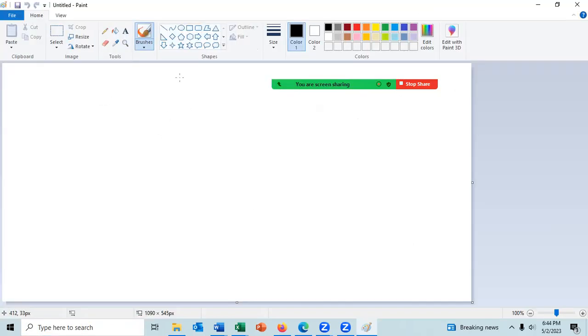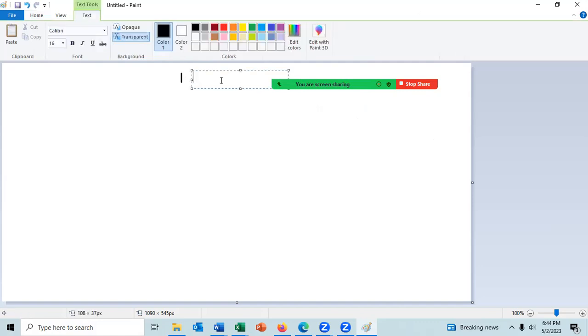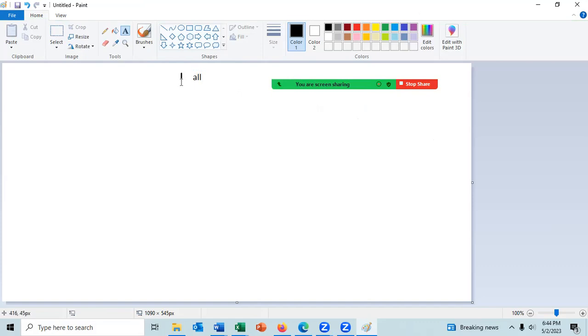Which initially we're kind of doing that, and that is we're doing gelatin hydrolysis test first. So we have all species. I'm just going to go all. And then you'll have the gram positive and the gram negative. Let's go gram negative here.